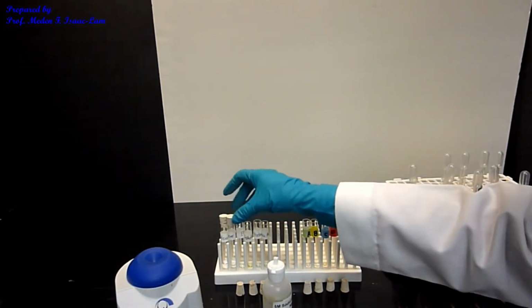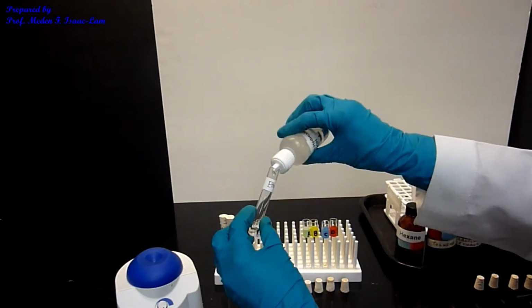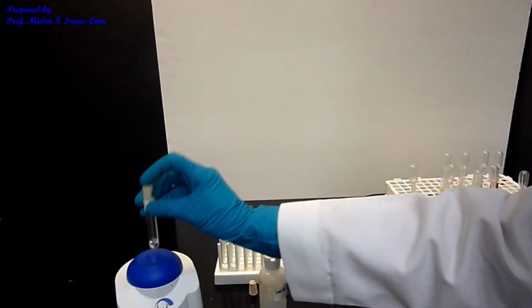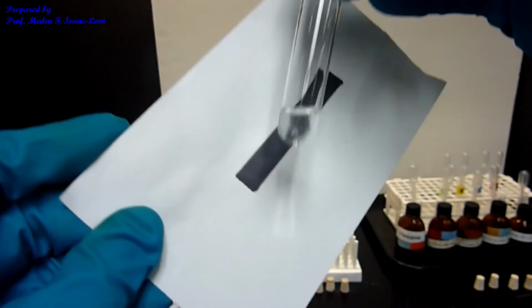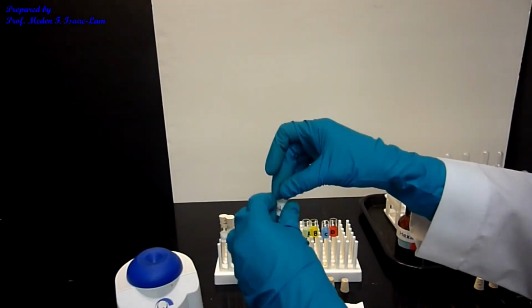And then ethanol. Okay. And then again, mix it up. So this is now your ethanol. So it's miscible. And now we're gonna do diethylamine.